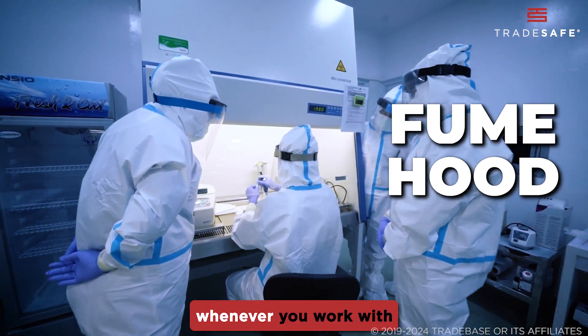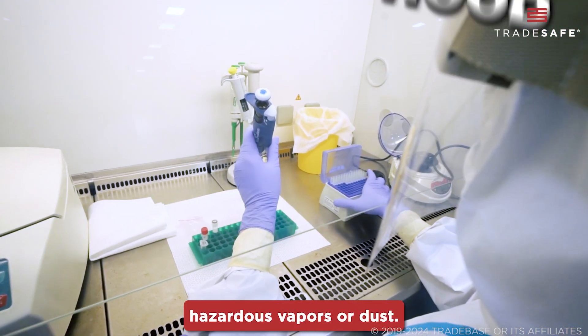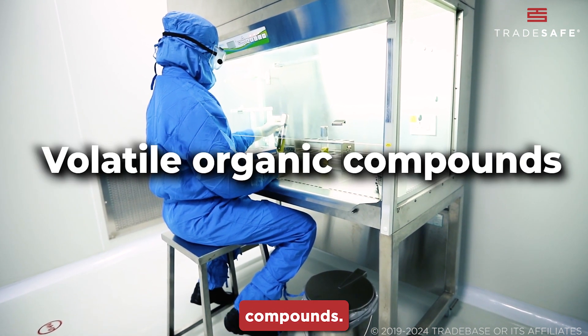A fume hood is used whenever you work with chemicals that emit hazardous vapors or dust. It's especially crucial for handling acids, solvents, and other volatile organic compounds.